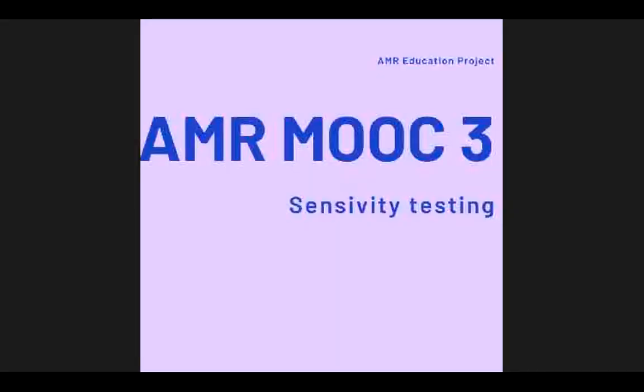In terms of whether there's any published research to say if the technique itself is as good, there isn't really. To be honest, there is research on the incubators and on the autoclaving of media. I think I shared one of the papers that looks at how if you microwave your culture, it's somehow better.